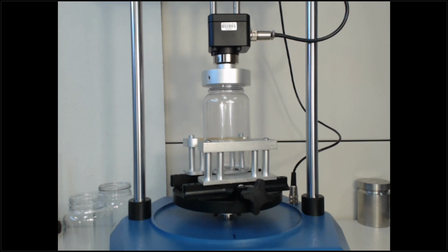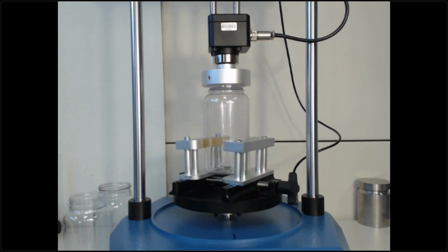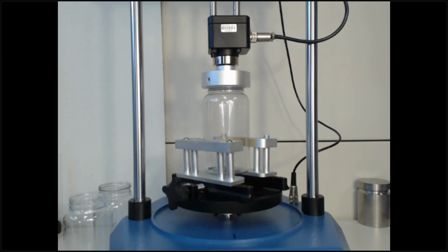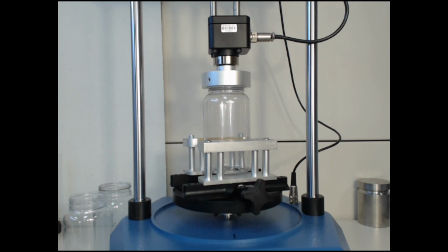What I'm going to do here, bear with me, is just return home, which essentially reapplies the torque. Then I'm going to run another one just so you get an idea of what that looks like. So I'm using a totally different simulated software here to run the test. As I mentioned, the focus is going to be on our 21 CFR compliant software, but unfortunately the compliant testers are not here, and that's the reason that we're running this way, just to show you what the test looks like.